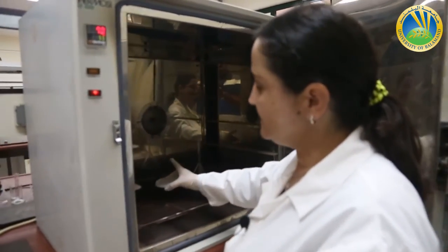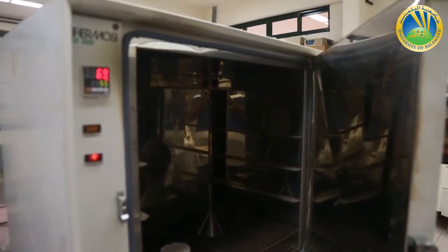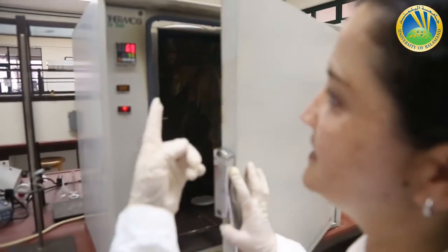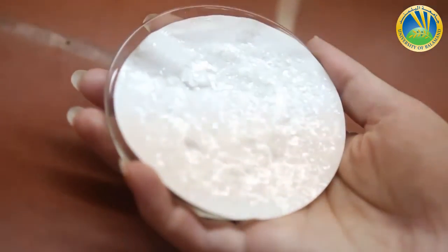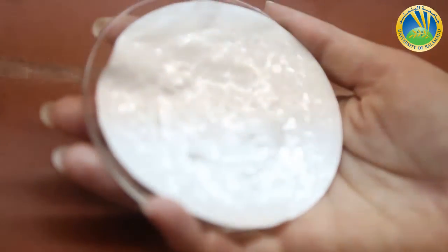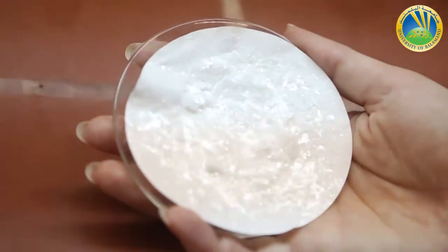I have to dry it inside the oven for some time at a lower temperature than its melting point, sure. So now the oven is at 68 degrees. After some time inside the oven, I have a dry filter paper with a dry compound which has the weight of 1.25 grams.